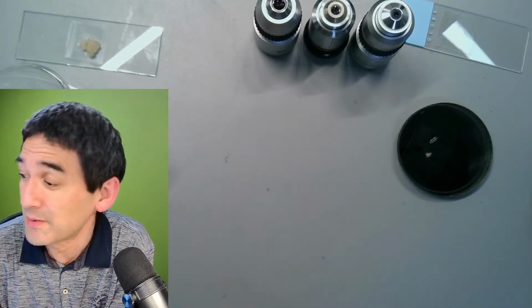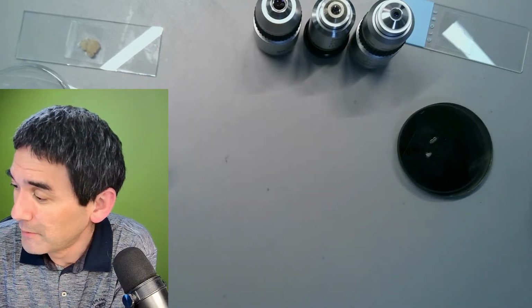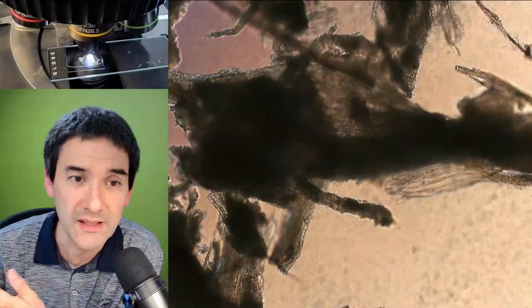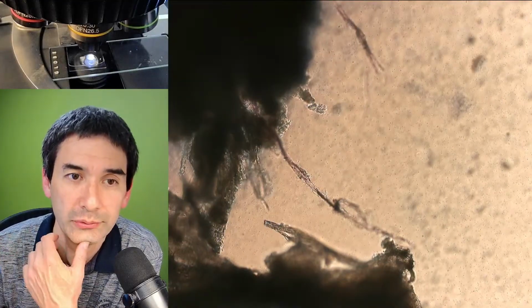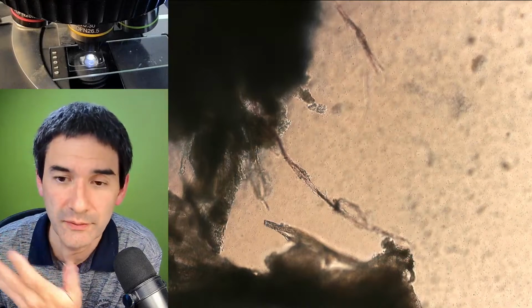Sometimes when you put stuff under the microscope, like the soybean meat right now, it's maybe not super exciting to see, but at least that's how it looks, right? And then we can have a discussion on whether those fibers that we see here should be in there or not. But at least it's authentic, and not some kind of fabricated thing.